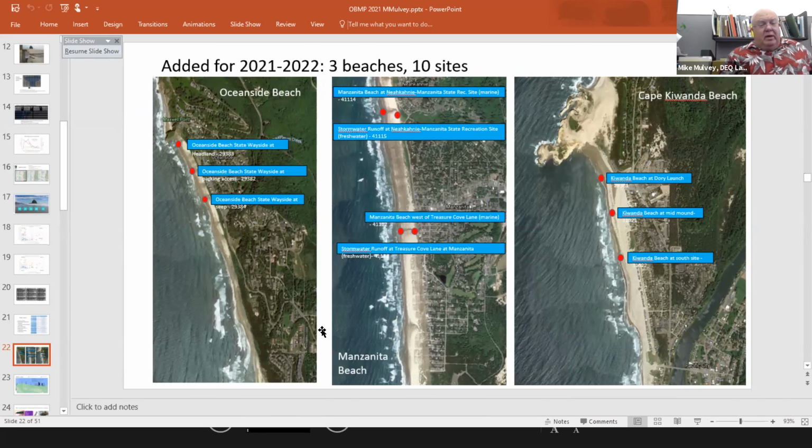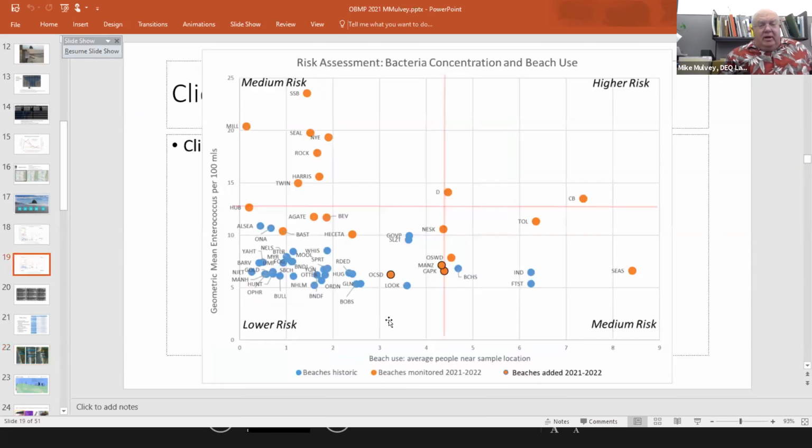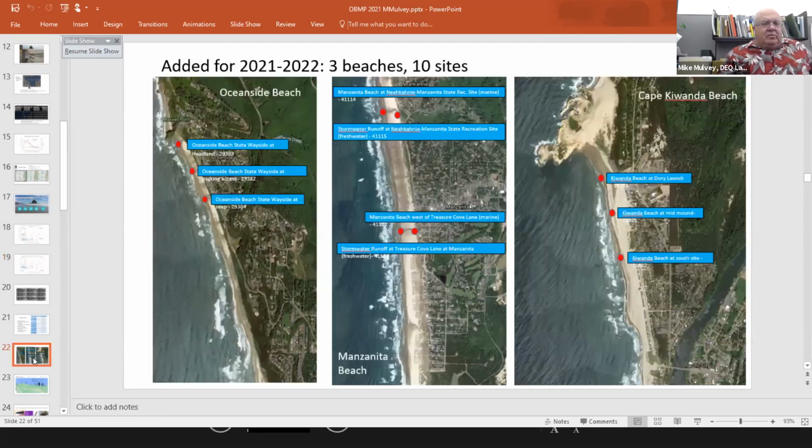If you remember where they were on this graph, they're down here at the low end of things. I should point out this geometric mean is a 1 to 10 dilution, just like Doug did. Our detection level is 10 enterococcus per 100 mL, and for where we don't get a detection, we use half the detection level, or 5, for the geometric mean calculation. So these guys down here are really very low. So there's our 3 beaches.